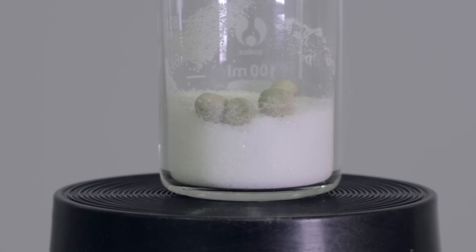The opposite phenomena can occur during fluidization, where larger denser particles sink to the bottom of a fluidized column and the smaller ones or lighter ones are lifted to the surface.